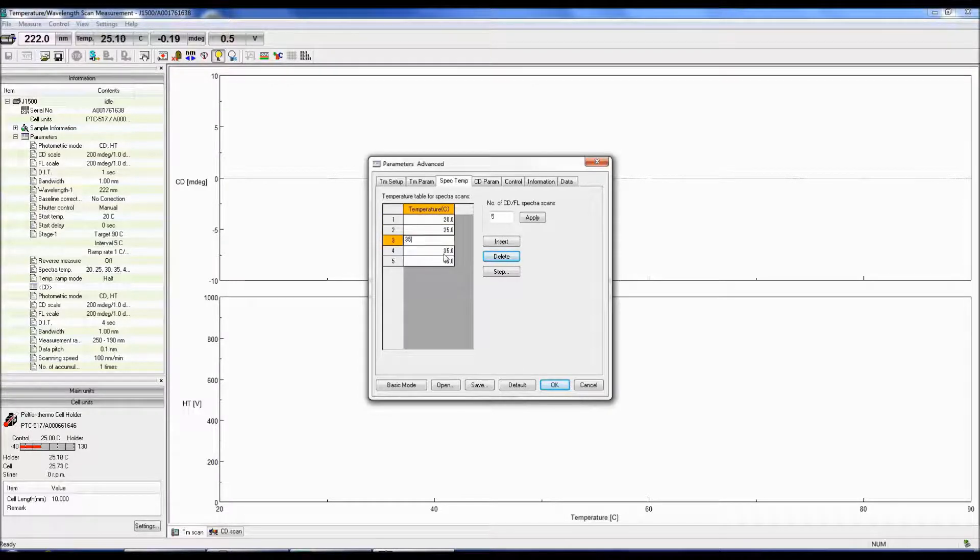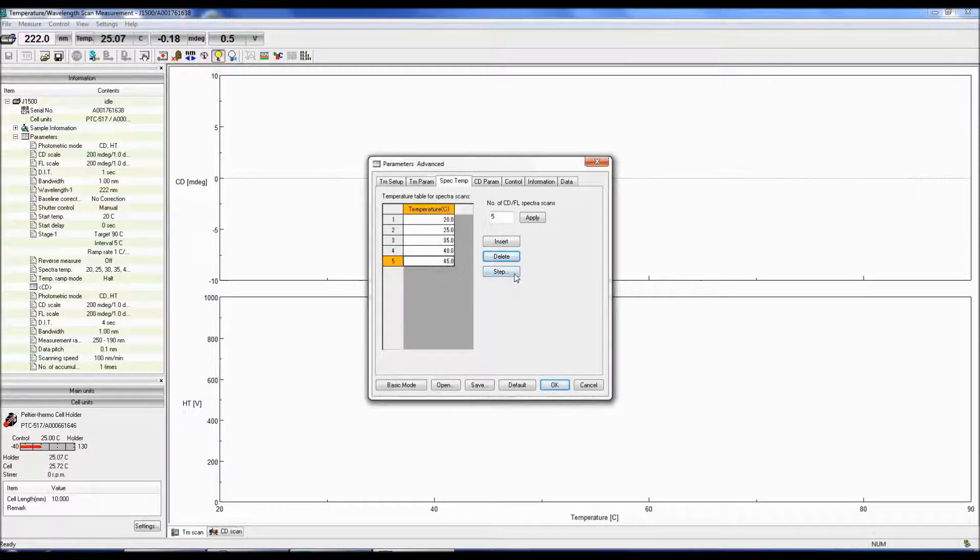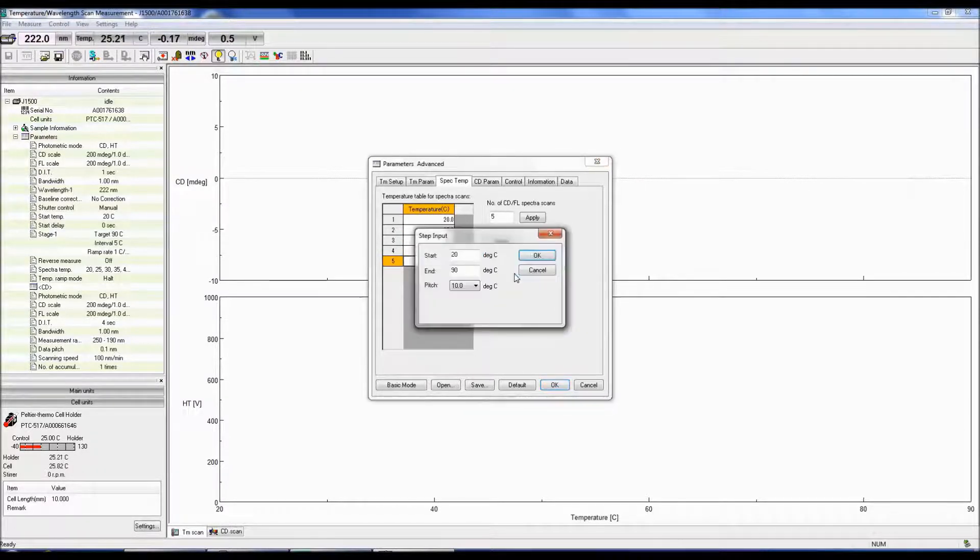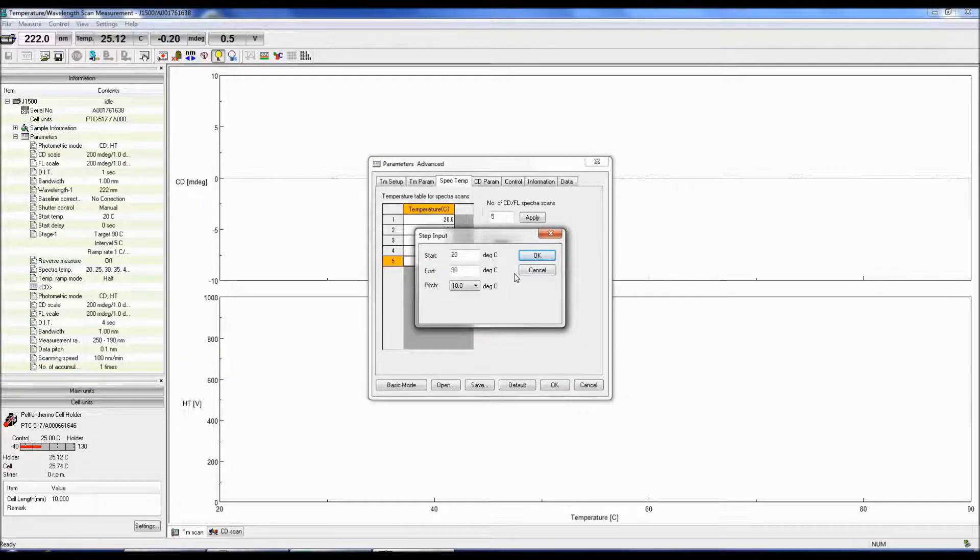However, instead of entering all the temperatures in the spreadsheet manually, you can also select the Step button to enter the start and end temperatures and the temperature interval to acquire spectral scans at.